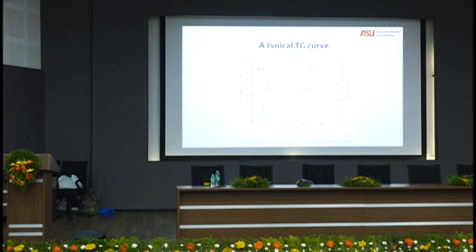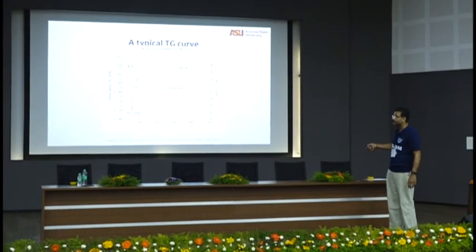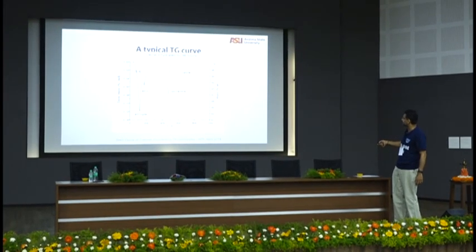So that's the mass. It starts at 100 total mass, and when you get to 1000 degrees Celsius, you have about 83% weight. So you lost 17% of the initial mass. Now you know that here it is still about 100. Then you can take the first derivative of that curve. That's the differential thermogravimetric curve. That's the first derivative, which makes the determination easy.